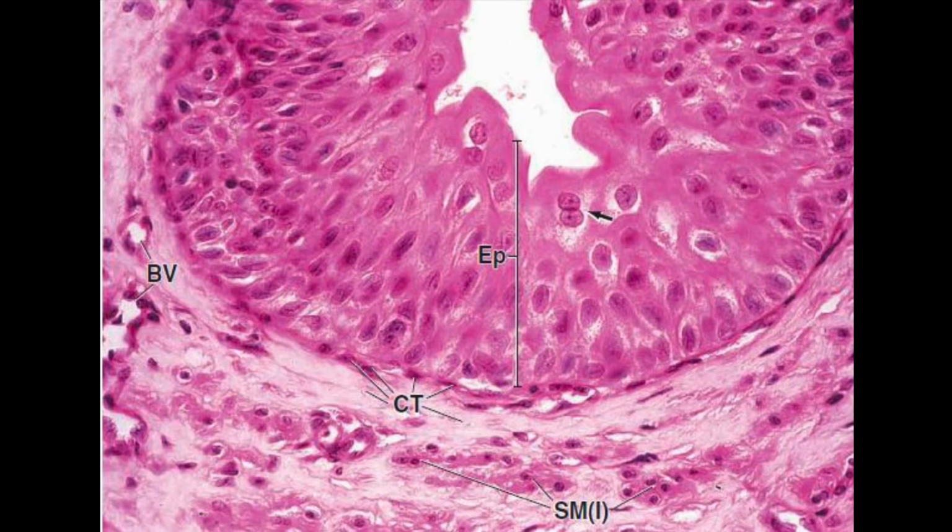This figure shows the inner longitudinal muscular layer at a higher magnification. We can clearly see that over here. And note the nuclei appearing in round profiles, indicating that the muscle cells have been cross-sectioned. This figure also shows the transitional epithelium over here, and the surface cells of the transitional epithelium, or the urothelium, are characteristically the largest. You can see the largest cells, and some are binucleate also, which is shown over here.